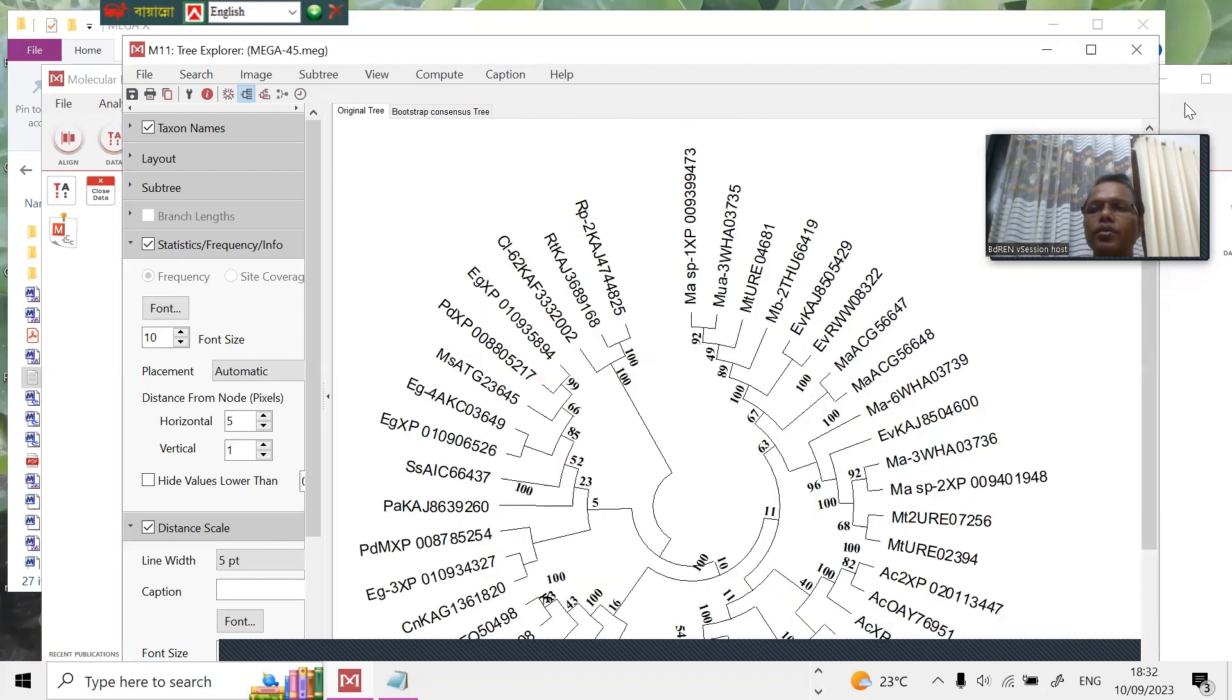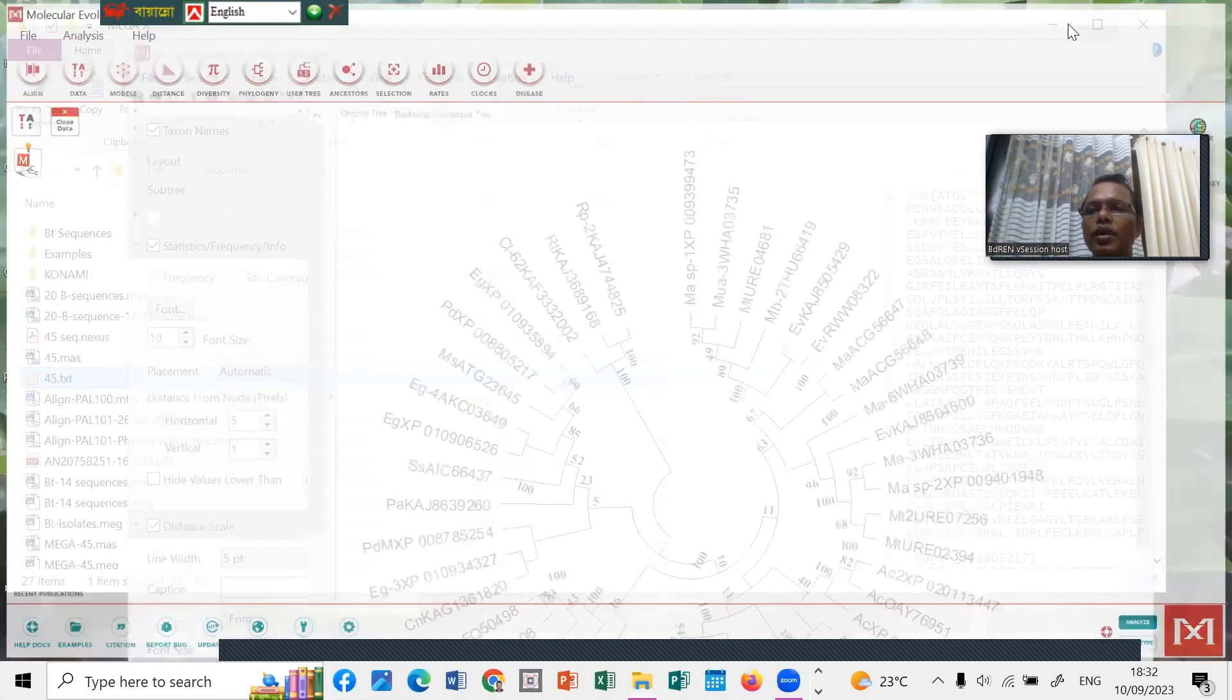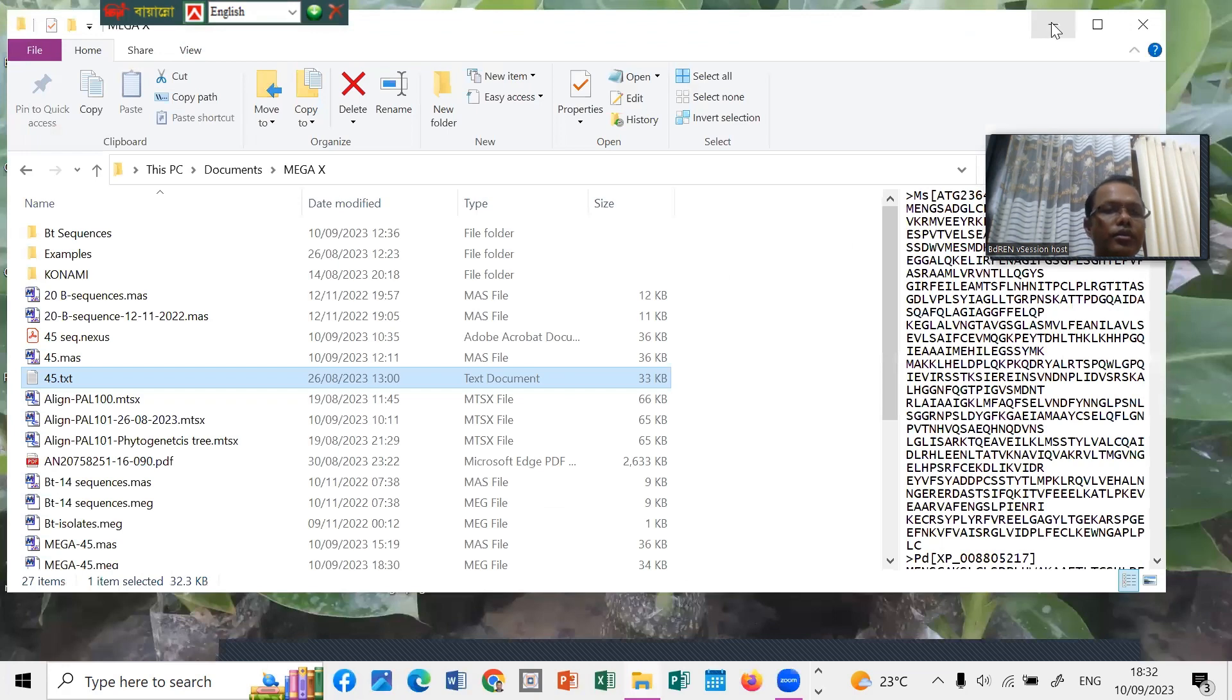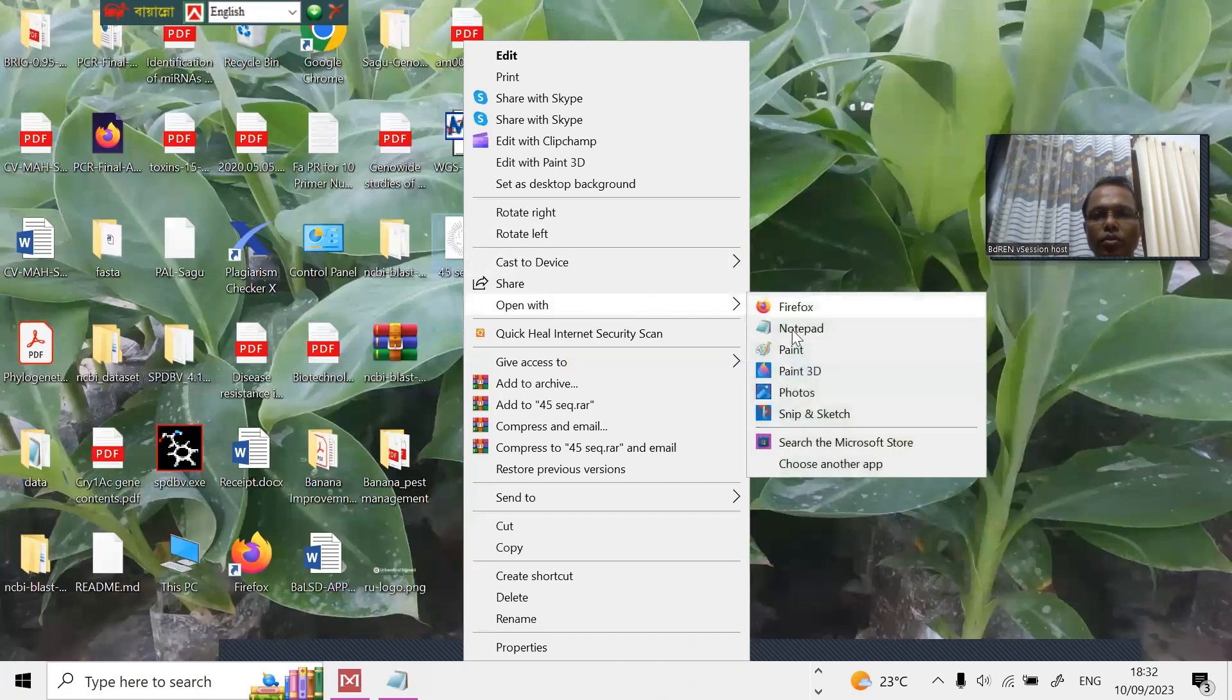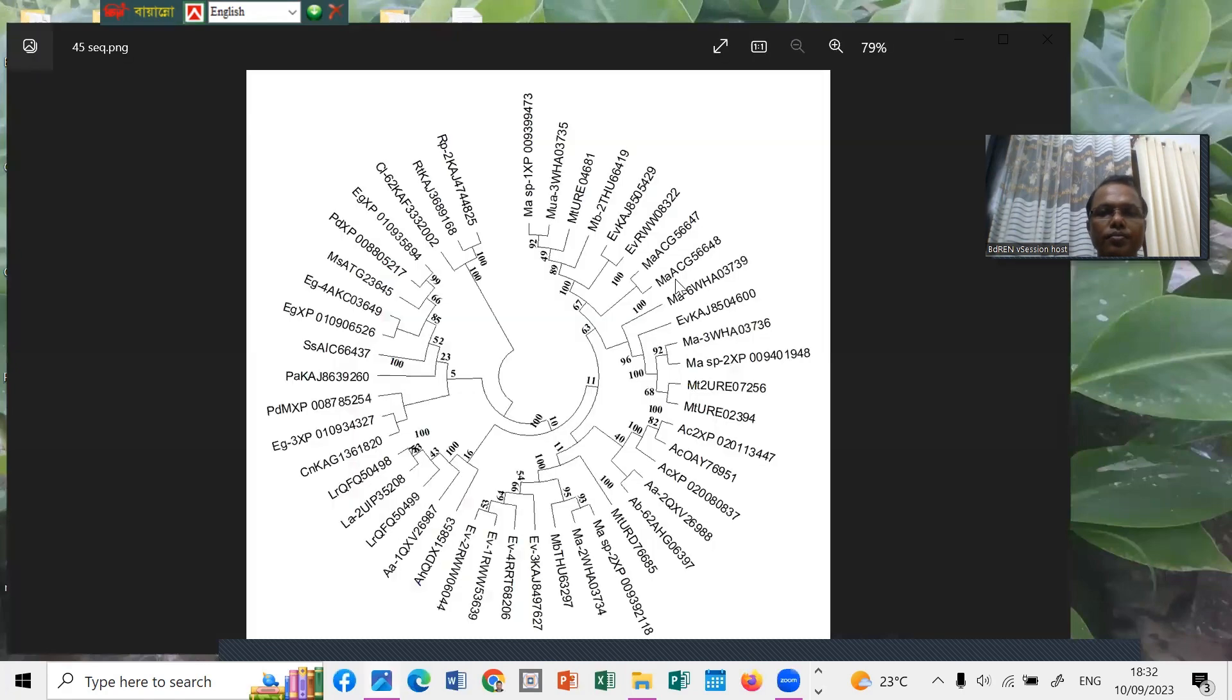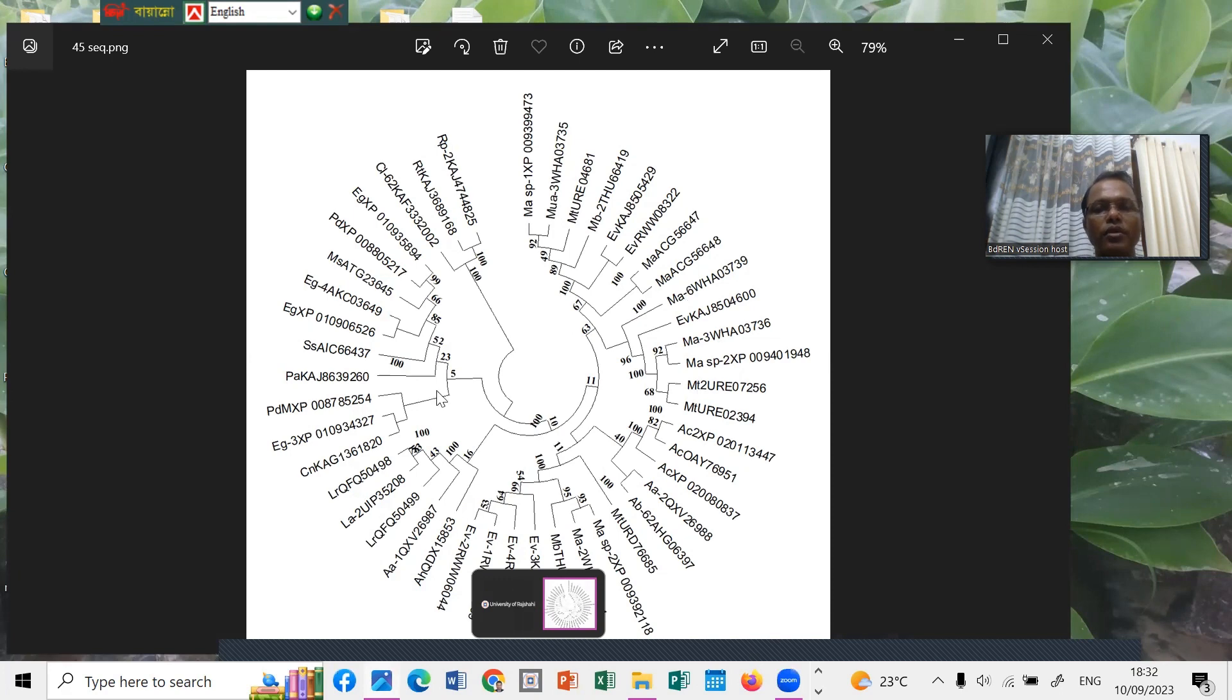You can see the desktop, 45, open with the photos. You can see very well, this is the phylogenetic tree. The whole phylogenetic tree can be easily constructed using MEGA 11.